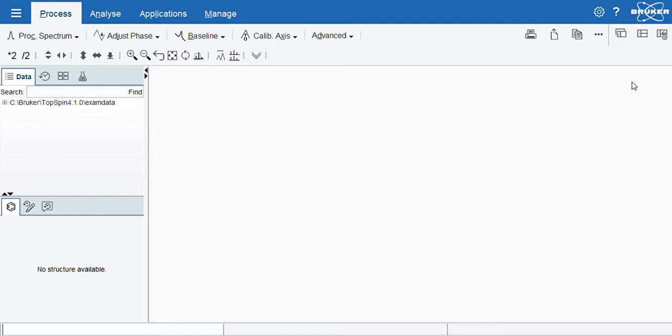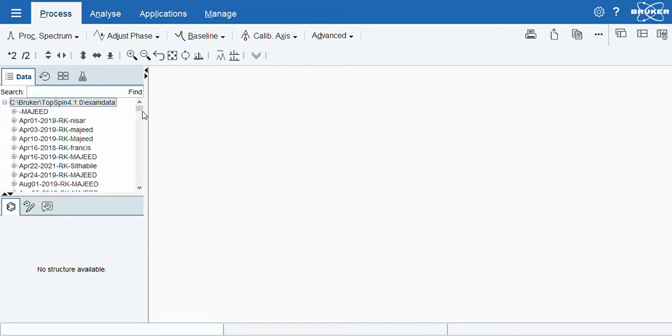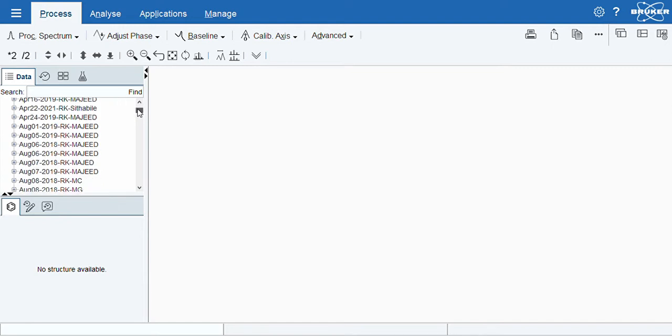Okay, till now we have an FID file. Now I copy the FID file and paste it in exam data, which is a folder inside our Bruker TopSpin. Then I just click it and scroll down and go to your target folder.